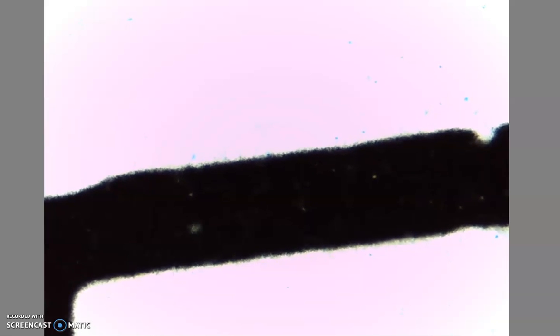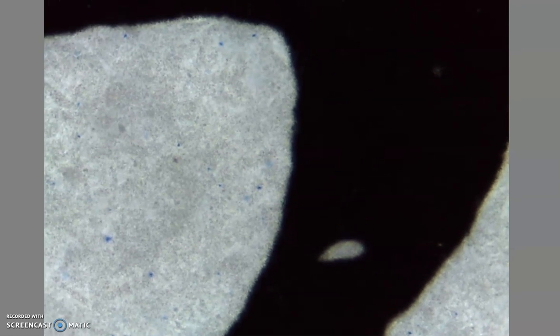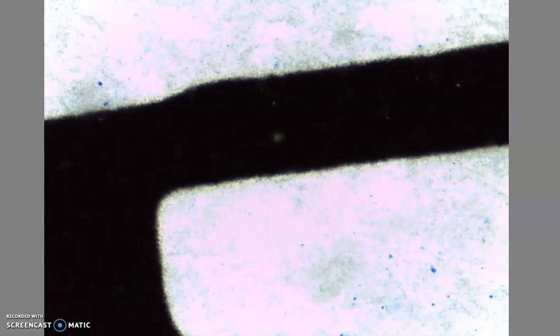Now if you do choose to move your E around a little bit, you can use the stage controls to do that. You have to be super gentle as you do, but you can then move around and see the other parts of the E a little bit closer. You can see there's an open spot on the side of this E, but you can move it around. You have to be very, very gentle, but it helps you to explore the close-up version of the object that you are looking at.